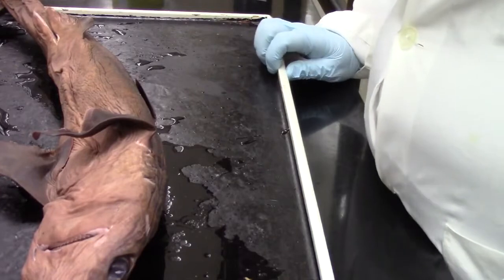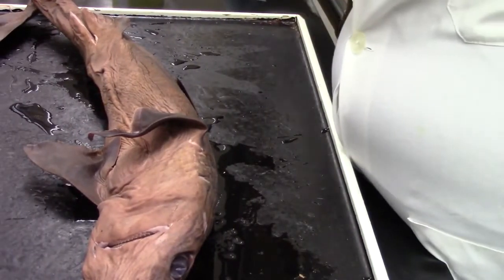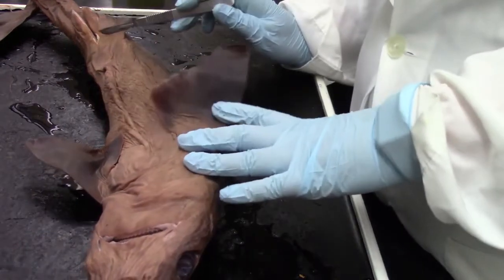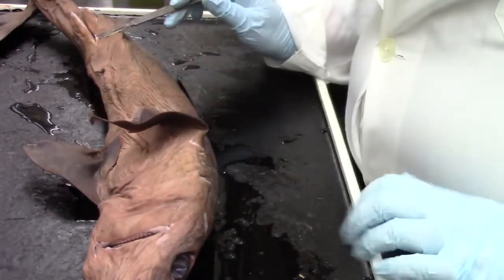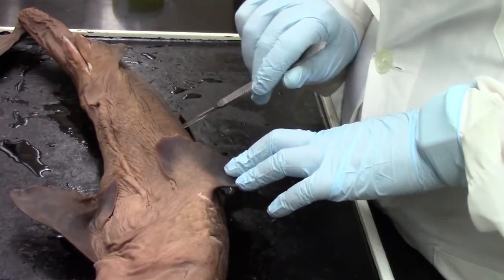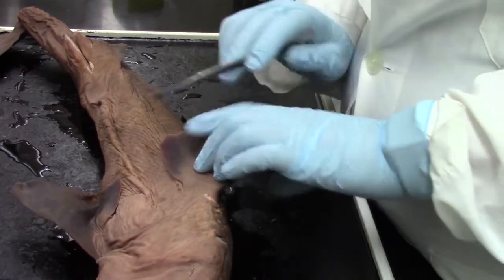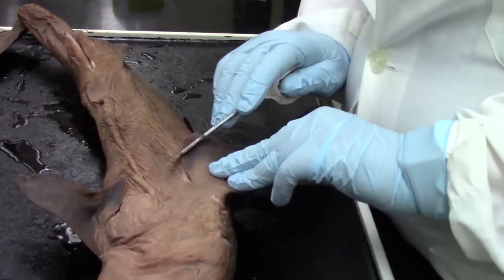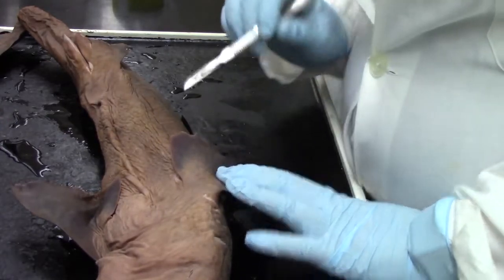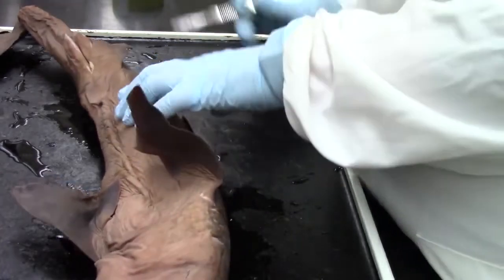So now we're ready to look at the internal anatomy of our dogfish. So for this, we're going to be making a cut. We're going to start down here near the pelvic fins. We're going to cut all along the side here. It's often easier to remove one of the pectoral fins, but I'm going to try to keep those in place for today. And then we can also take a look up closer to the gill slits. So this is just going to take me a little moment of cutting.